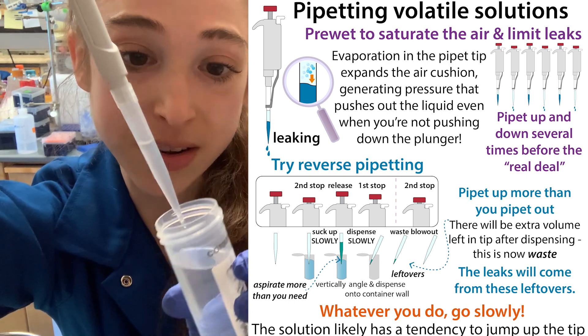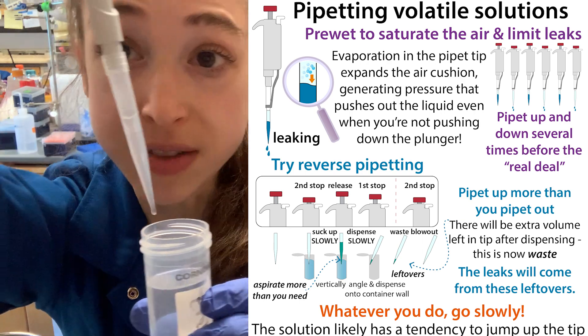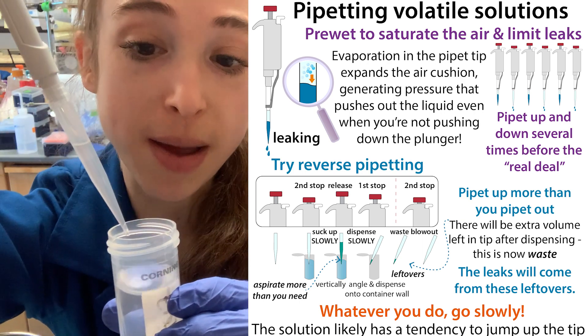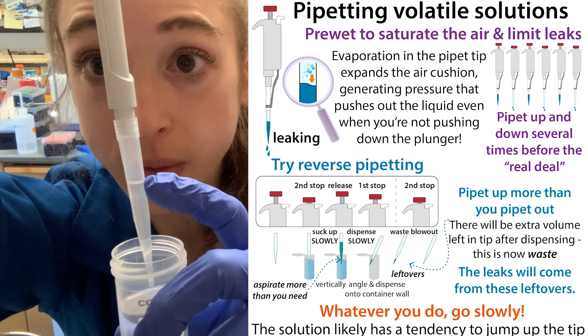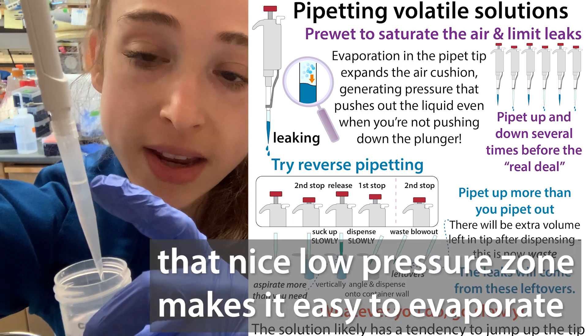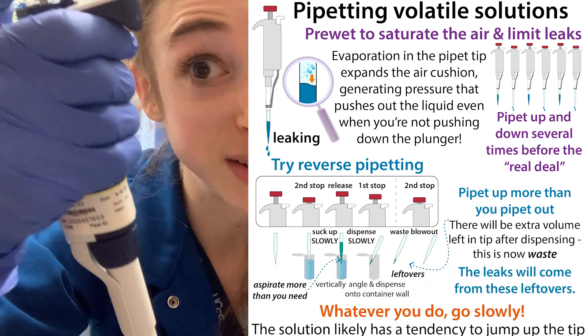Have you ever tried to pipette an ethanol solution and it just drips out? This happens because ethanol is volatile — it evaporates easily, and it's going to evaporate in the air cushion above the liquid in your pipette, causing that air to expand and putting pressure on the liquid, pushing it out even when you're not pushing down the plunger.